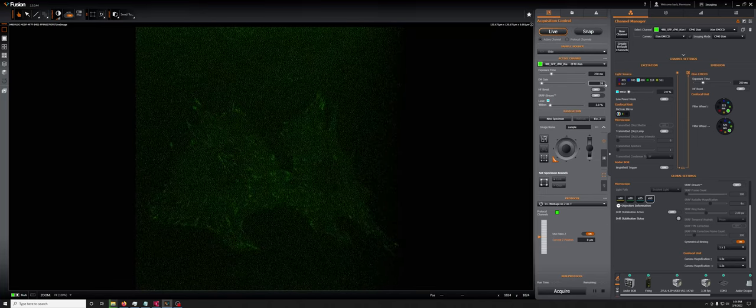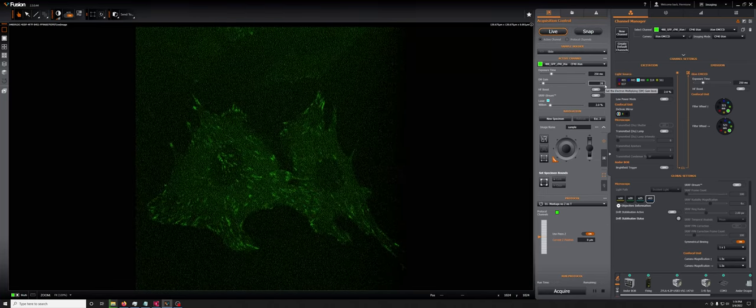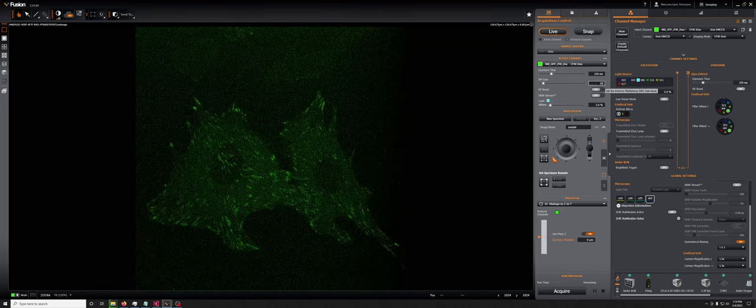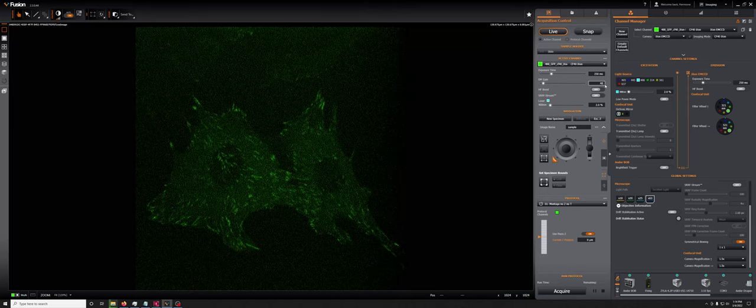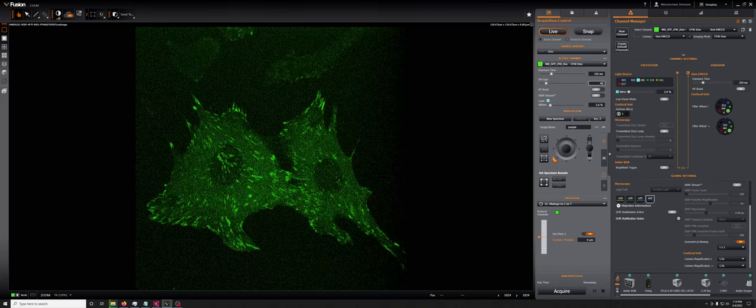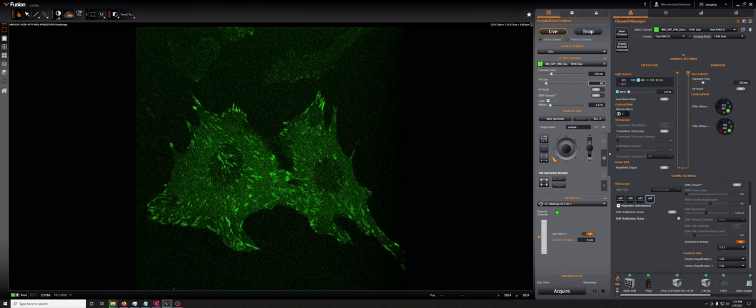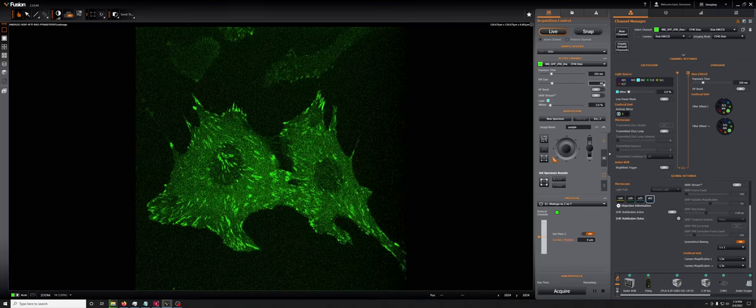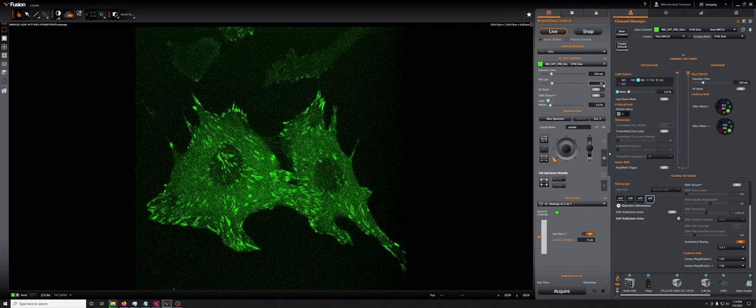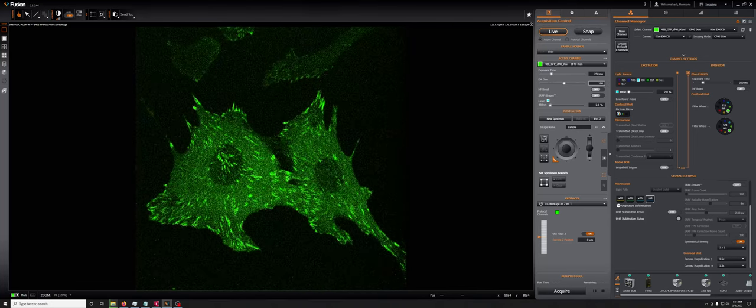If we double it to 20, you can already see a dramatic improvement. If you go to 40, it gets even better. If you go to 80, it gets a little better.